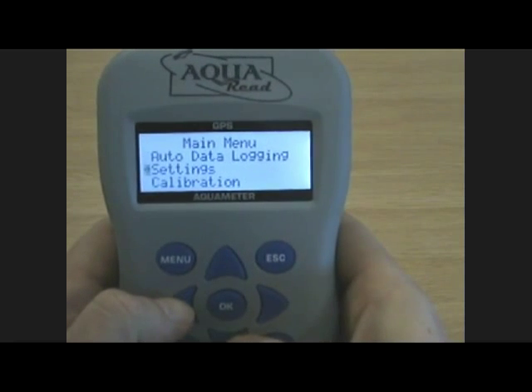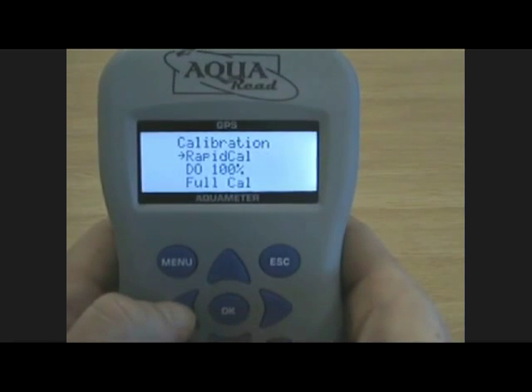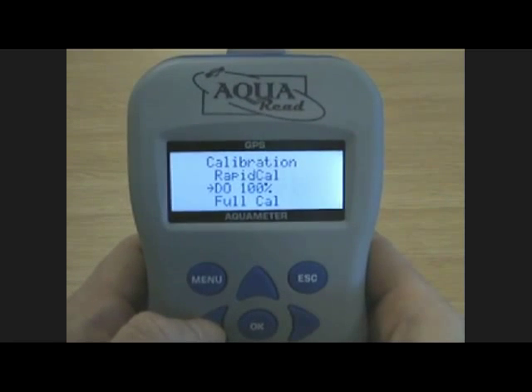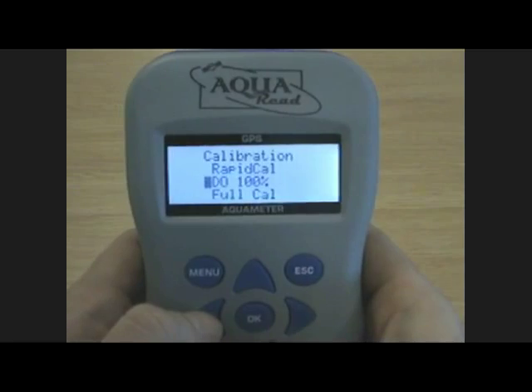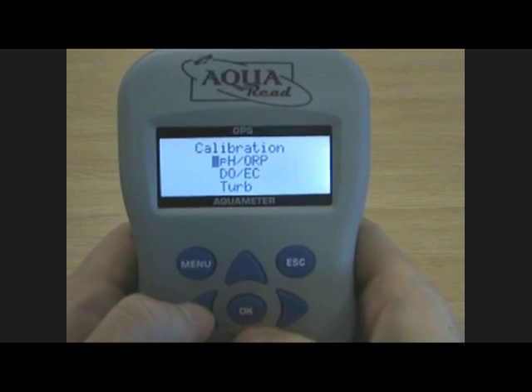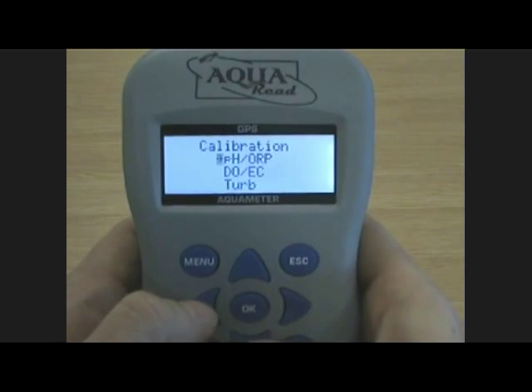Finally, there's calibration. In here, you'll find three options. The first is rapid cal, intended for calibration in the field. DO 100% for quick DO calibration. And the full calibration options, where you can perform two point calibrations on pH, ORP, DO 0% and turbidity.